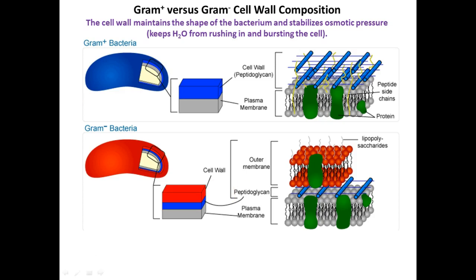So gram-negative cells are going to become decolorized, and then they're going to stain with the counterstain and come out pink. And the reason for that is this thinner layer of peptidoglycan they typically have. And they typically also have an outer membrane. So this is an additional membrane to the plasma or cell membrane that all cells have. And of course it's the outermost covering in this case. Its very outer layer is made of a different substance than phospholipids. It's actually lipopolysaccharides. The bad news for us is this can be very toxic, and this is why gram-negative infections can be really serious.